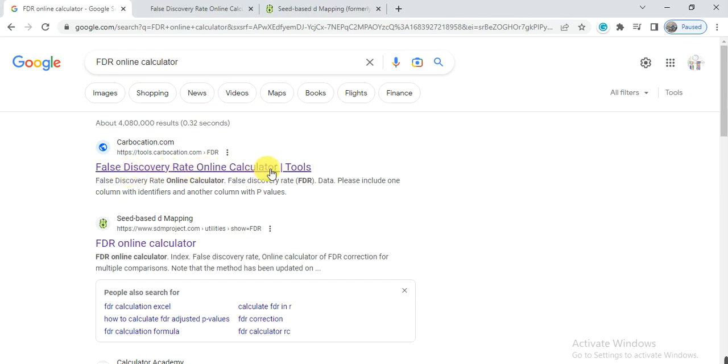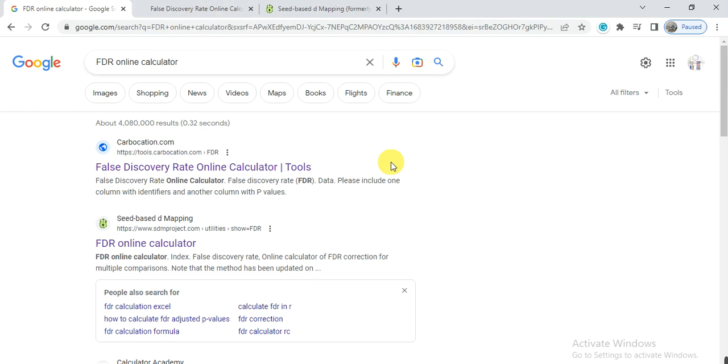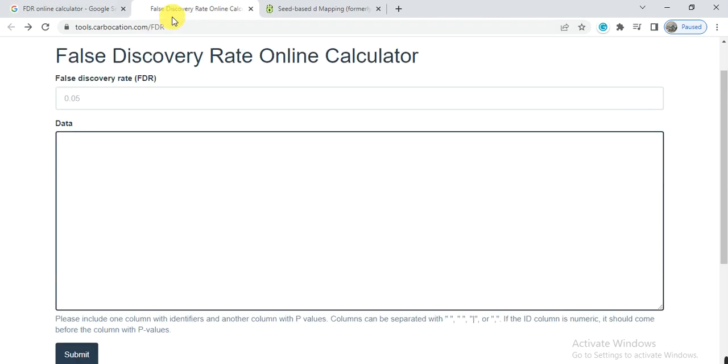There are two websites through which we can easily convert these p-values into p-adjusted values. We will try both websites one by one. First we will open the False Discovery Rate online calculator.